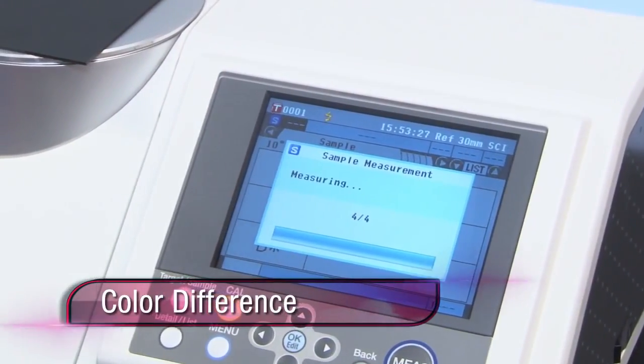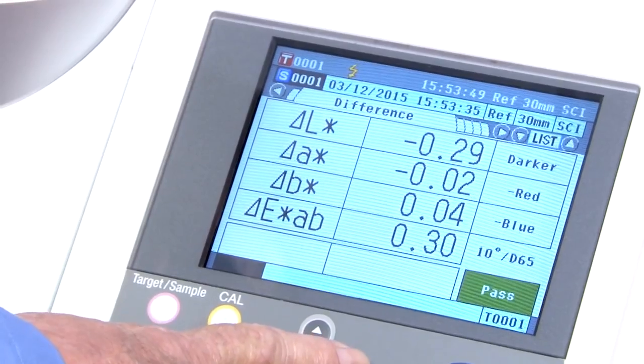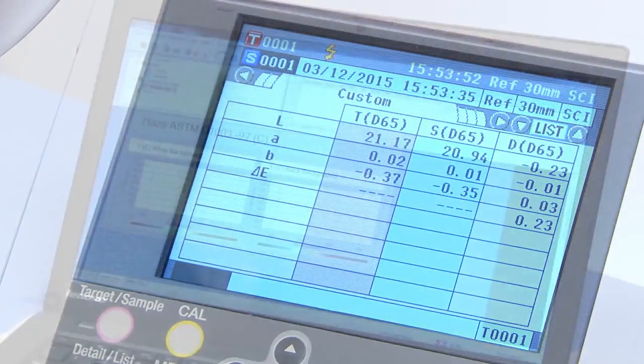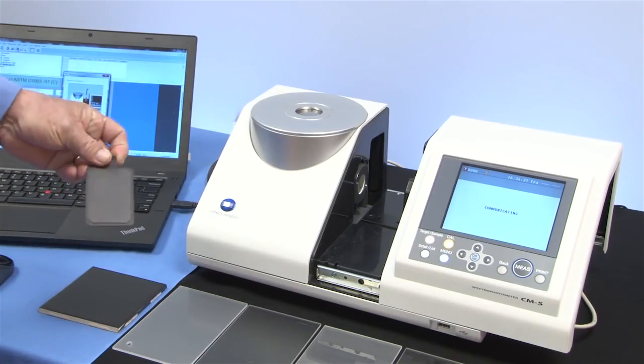The differences between the sample and standard are calculated using the resulting colorimetric values. Differences are shown numerically to identify color inconsistencies between products. For haze measurements, the CM5 is driven by user-friendly Konica Minolta Sensing SpectraMagic NX software.